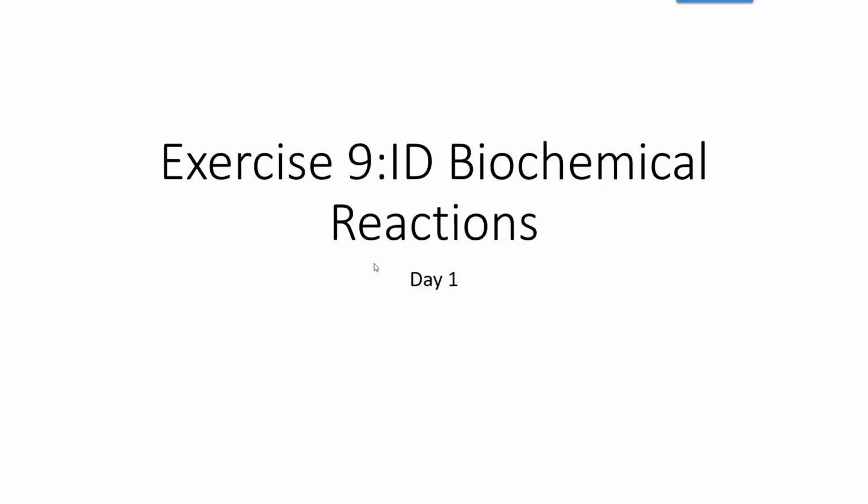In this video, I'm going to go over all the biochemical reactions that we use to help us identify specifically gram-negative bacilli, or gram-negative rod bacteria. There are quite a few biochemical reactions. We normally go over these in two separate weeks of setting up various tubes, and then we spend another lab reading and analyzing all the tubes.